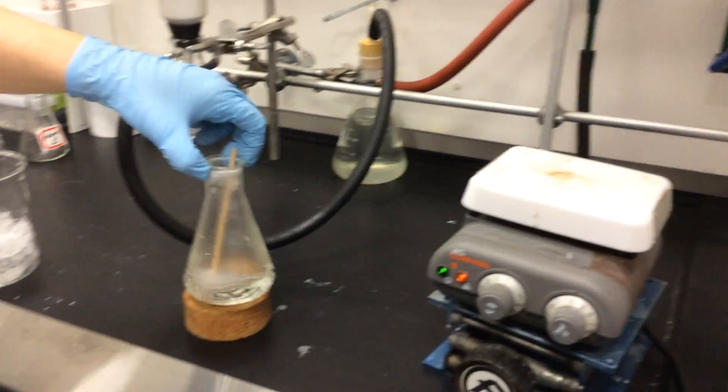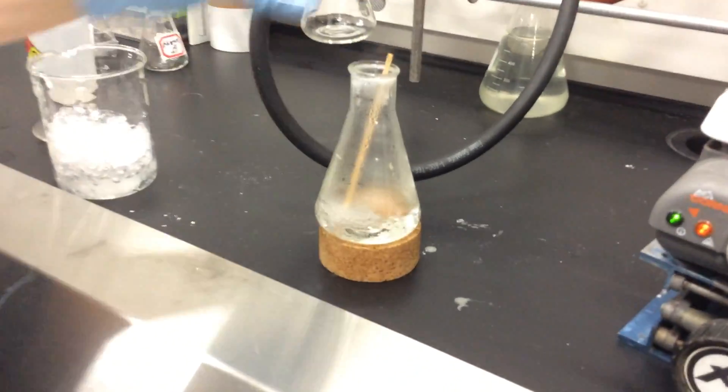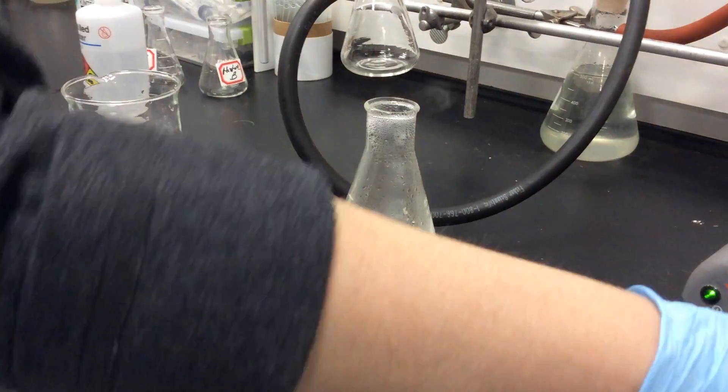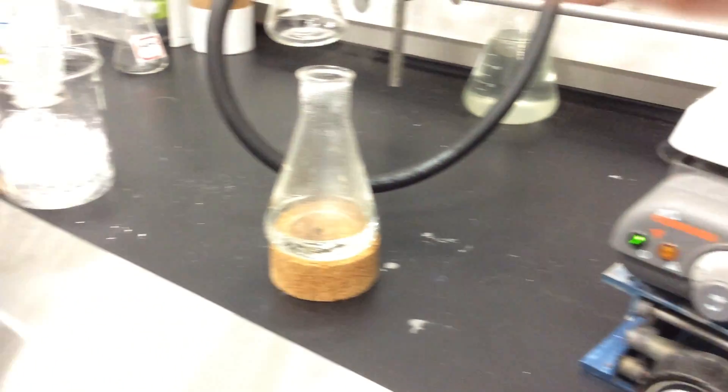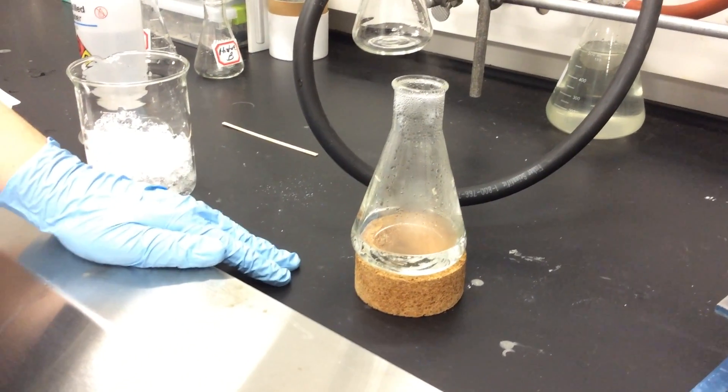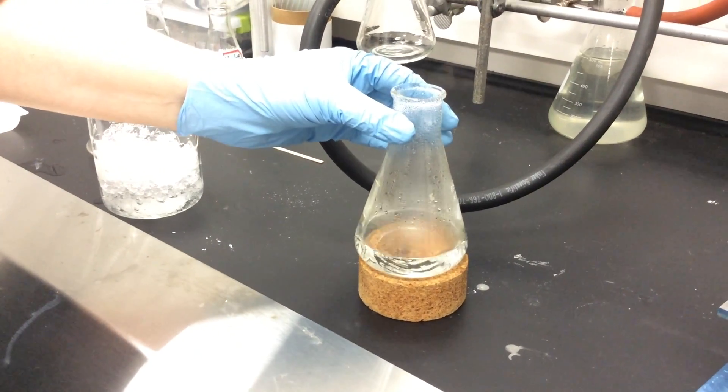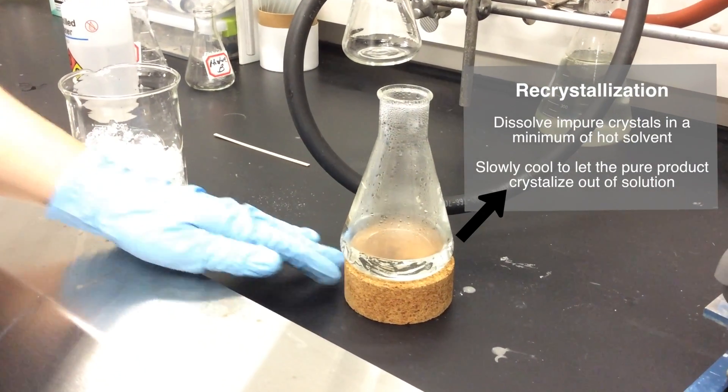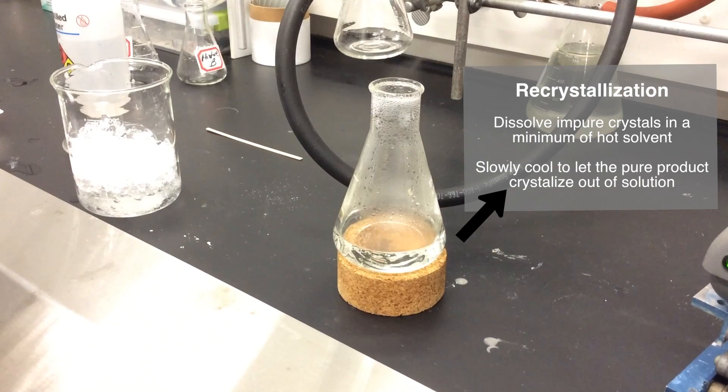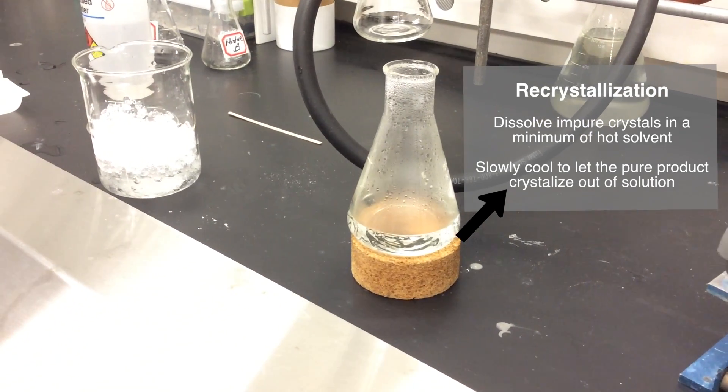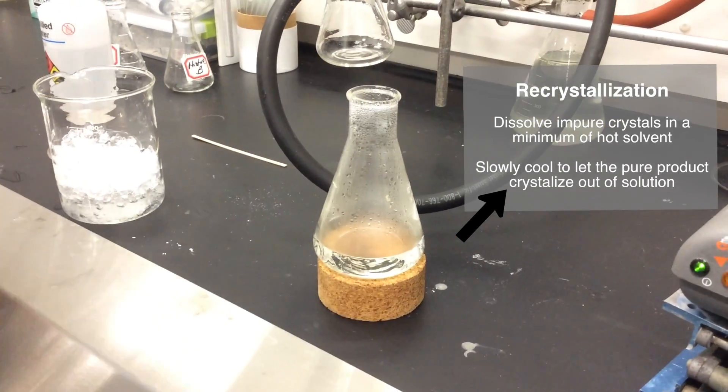And once the solid's all dissolved, we'll put it on a cork ring so it can cool slowly, take out our coffee stirrer, turn off our hot plate, and just let that sit. Let that sit until it comes to room temperature. We want to make sure that we have slow cooling so all the pure crystals will fall out of solution and all the impurities will stay in solution.